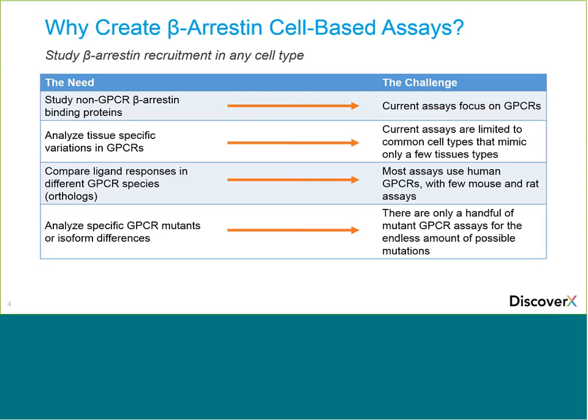If we focus at the bottom, it's a very easy to use, homogeneous, endpoint assay system that doesn't require control of reaction time. In the image, you see that the EFC technology is based on a split beta-galactosidase enzyme. These 2 recombinant beta-gal fragments: one is a small peptide fragment, you see as the red squiggly line, and then a larger protein fragment called the enzyme acceptor. So the enzyme donor and the enzyme acceptor.